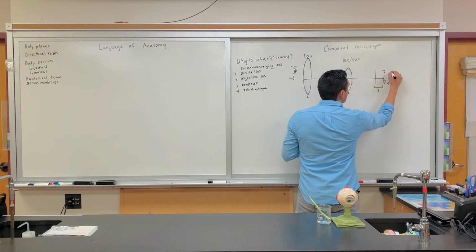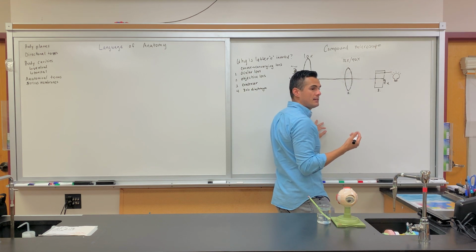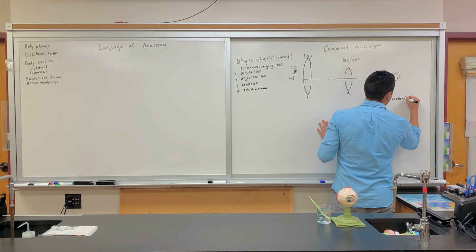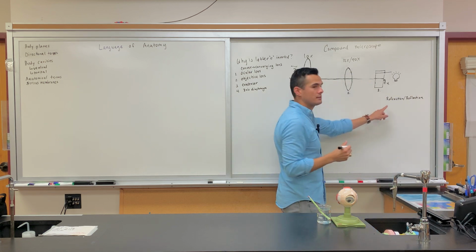So it'll pass here through the condenser, okay, and a phenomenon happens. This phenomenon is known as refraction.